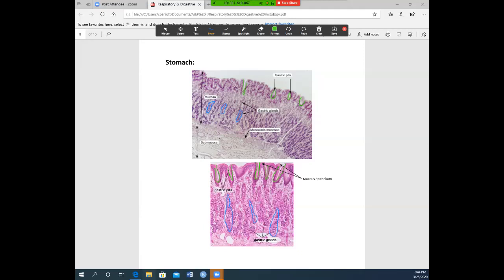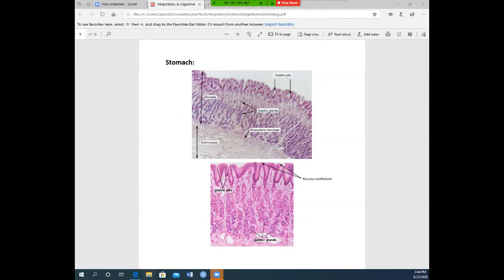This organ or tissue is the stomach. The two things to label are your gastric pits and your gastric glands. You do not have to label the layers such as mucosa and submucosa from this microscope slide.